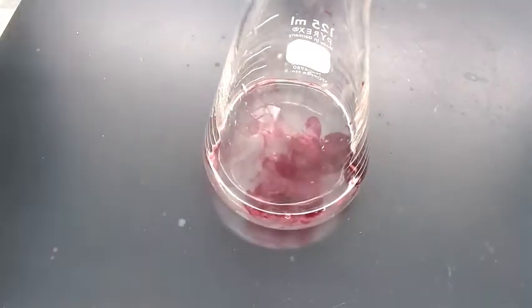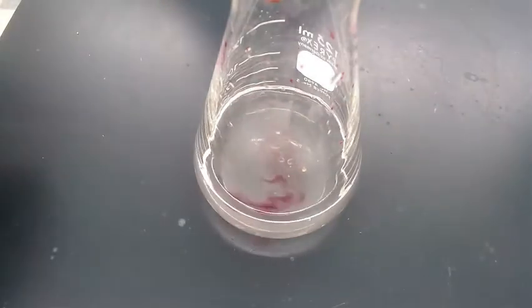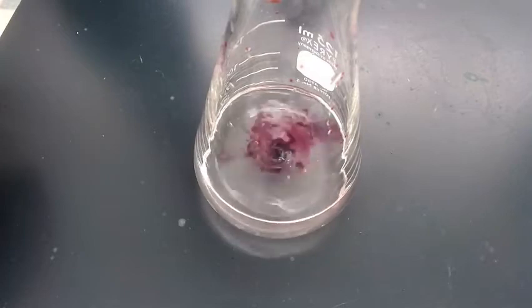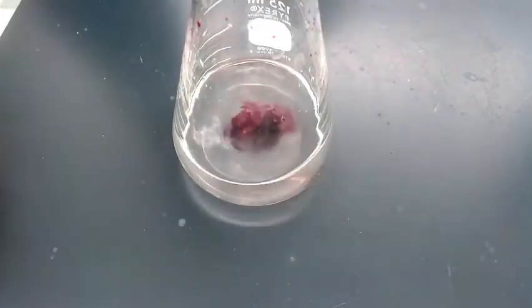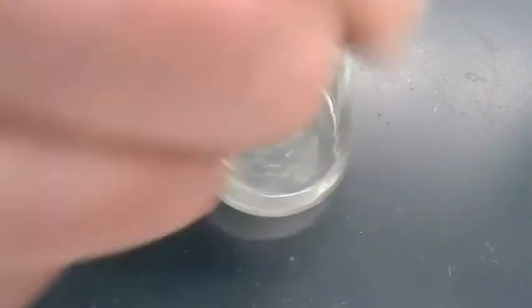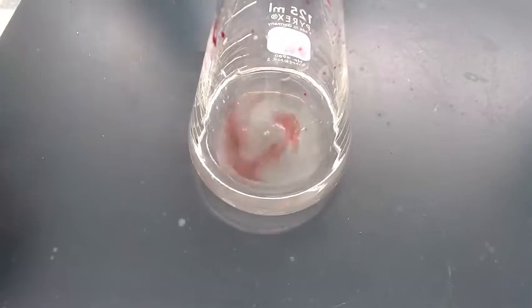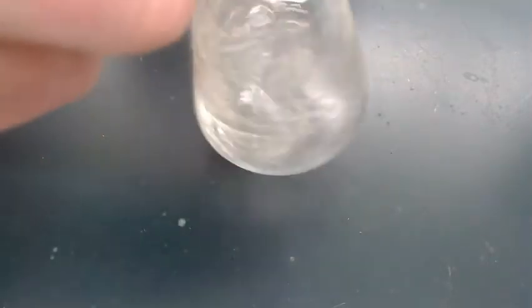So I'm putting in some solution, and there goes the purple. Putting in some more solution, there goes the purple. And again, with a titration, you have to know how much you put in. Well, in this case, I'm just drawing it out of the container and putting it in. I'm not being very technical here. We'll talk about how we would be very technical. I just wanted to show you as a demo what happens when our manganese changes oxidation number.